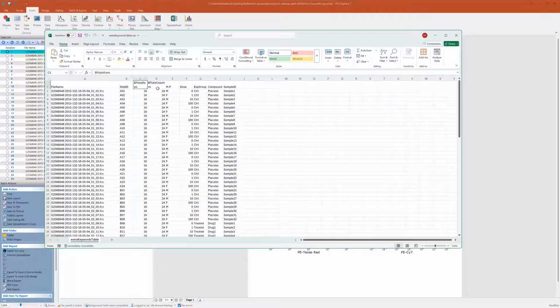And then we've also indicated the number of rows that were in the plate and the number of columns that were in the plate that was sampled. And this can be useful. This is not necessary in all cases. This can be useful if you'd like to be viewing your plate-based data on a plate heat map.